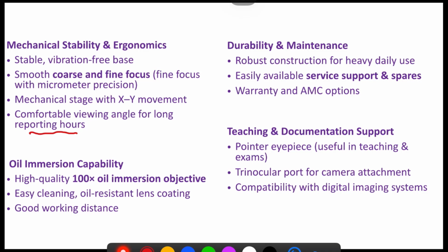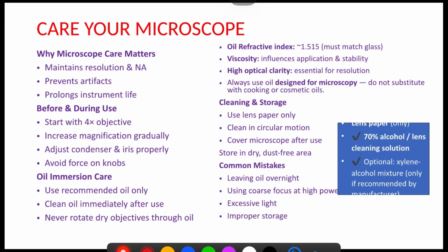Teaching and documentation support in the form of a pointer eyepiece, which is useful in teaching and exams. A trinocular port for camera attachment, and compatibility with digital imaging systems. So whenever you purchase, you should correctly see all these parameters and purchase accordingly.